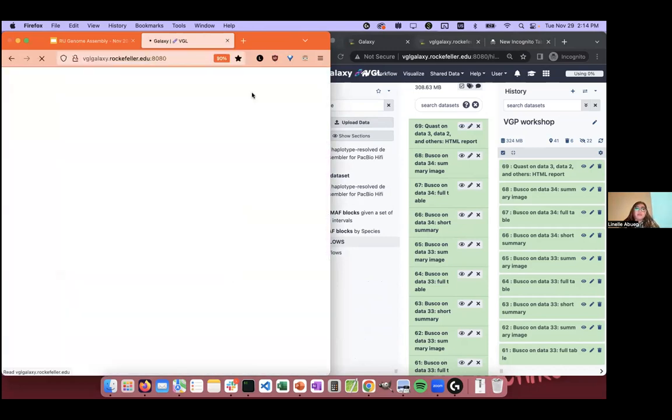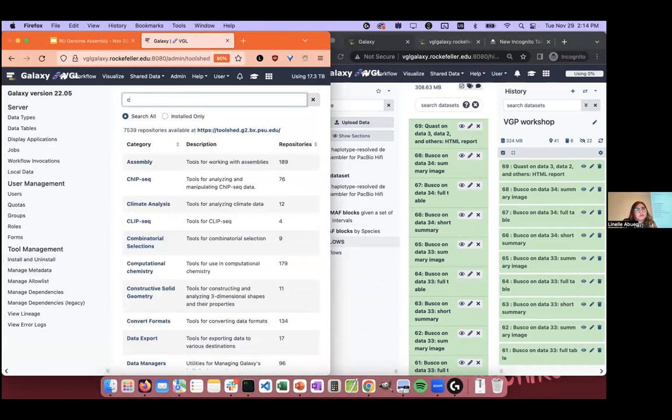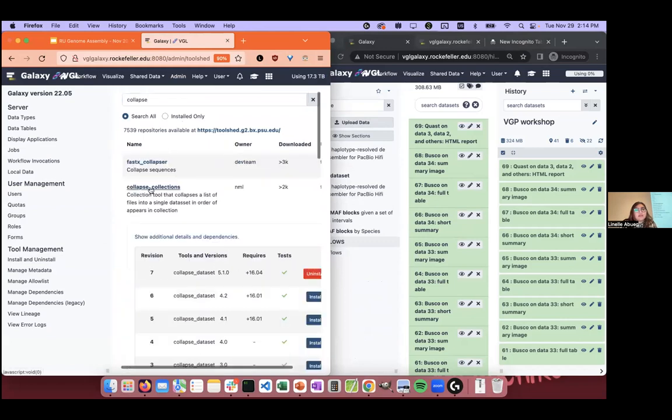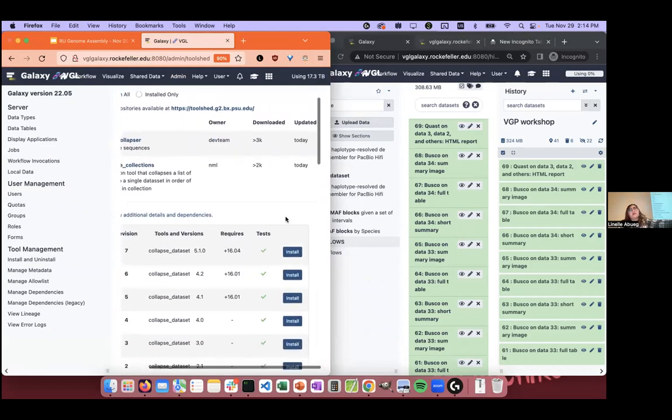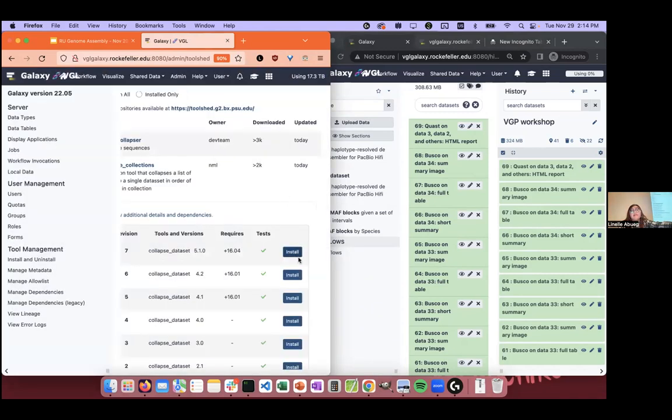Quick adminning. Sometimes the tools just don't want to show as installed for everybody. So let me make sure I have this. We'll do a quick uninstall and reinstall. After this says done, then refresh your page and I think it should show up. This is not something you're doing, sorry.